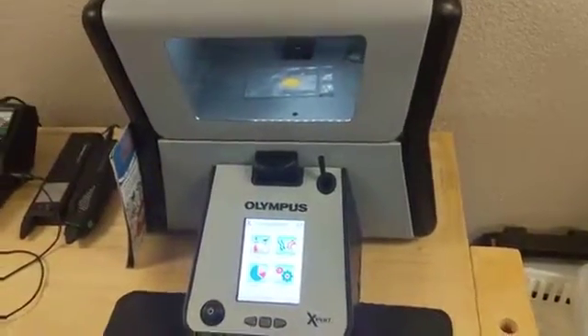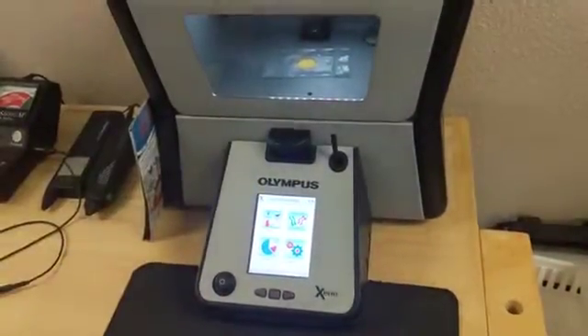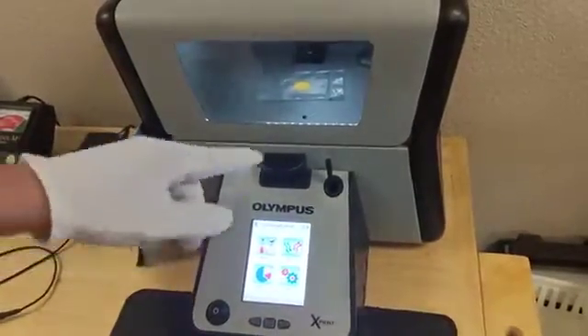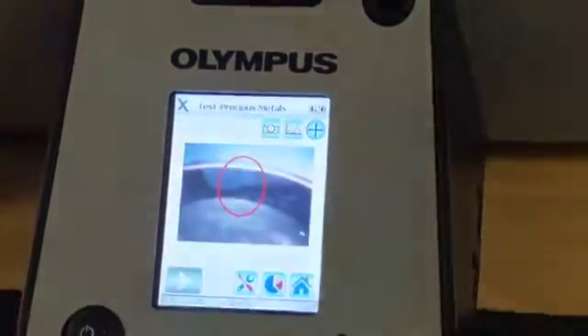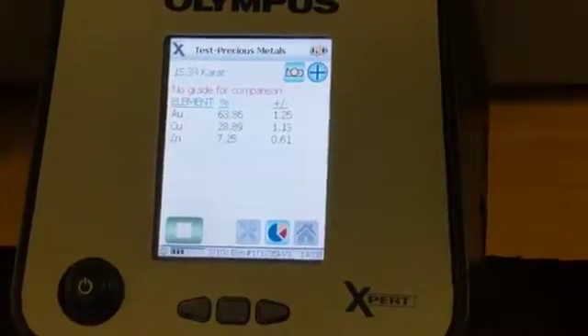So you come in with your jewelry — we haven't even made an offer yet, and we're certainly not going to damage your item before we're even able to give an offer. So we'll just open this up here, place it in there, select test on our x-ray. We'll get our camera going, get our cross section on the piece. I'm going to hit play — it's going to start x-raying. It's testing. It takes about 10 seconds to do its full test.